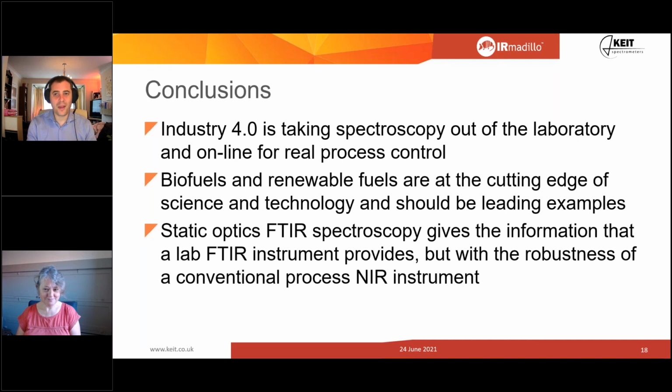They produce vitamin, I think it's vitamin A, and chemically that's a horrific number of reactions. It's like 12 different cascading reactions to do it. And the very first step is something called a Darzens reaction, and they analyzed it for about 40 minutes, and they thought that's how long it took. From experience, this is how long the reaction takes. We always leave it this long. And I said to them, okay, that's fine. Send it to me, I'll have a look at it for you and I'll let you know. And they couldn't get me any reference data because it was too fast. The reaction process was too fast.